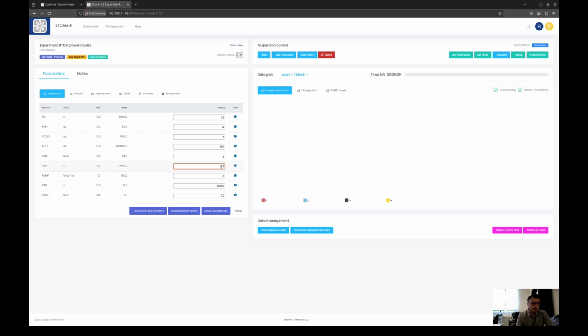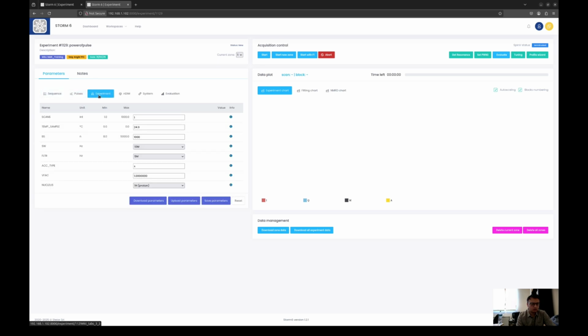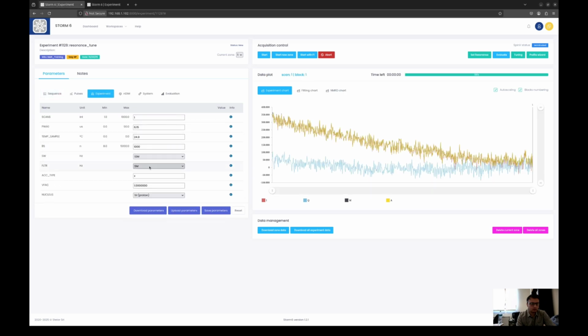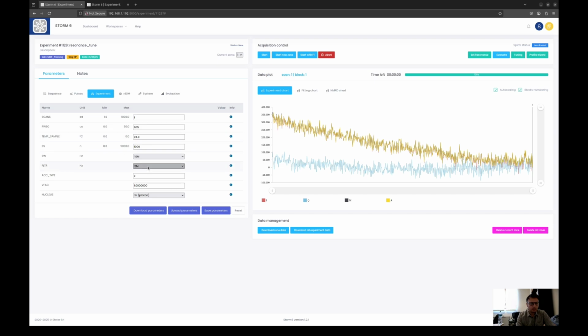So I gave it 0.5 as tau. We are relaxing at 8 megahertz, and other parameters are mostly okay, and these should be the parameters which we have already used when getting the resonance condition. So we use 10 and 5. We will use 10 and 5 again here, but I think instead of 10 and 5, let's go with some filtering.